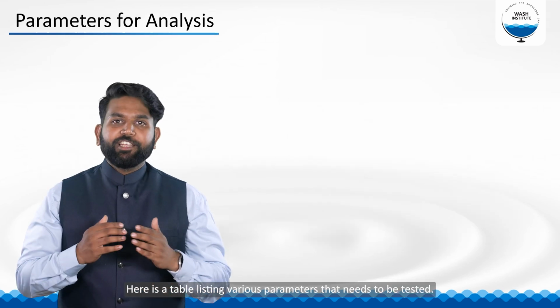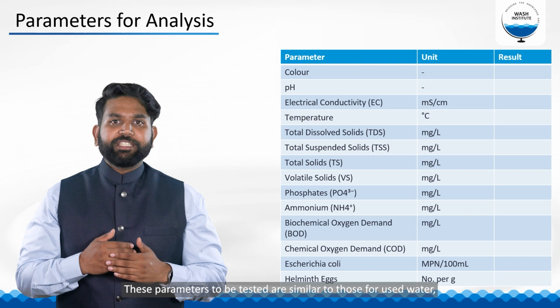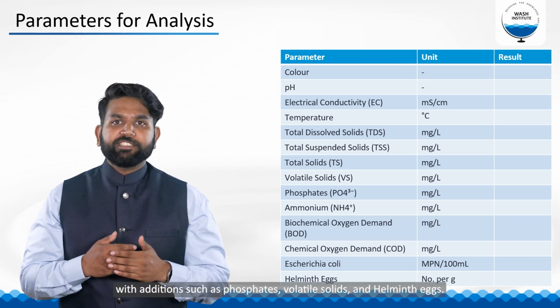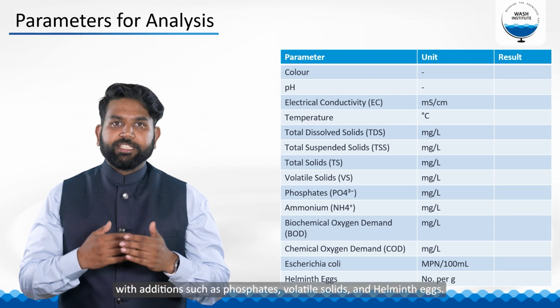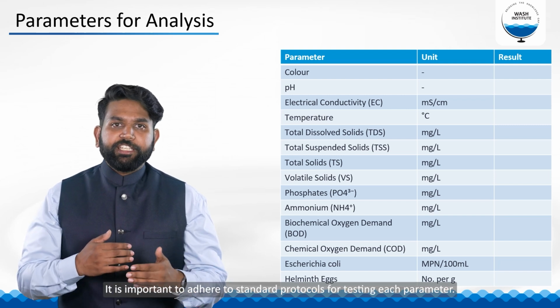Here is a table listing various parameters that need to be tested. These parameters are similar to those of the used water, with additions such as phosphates, volatile solids, and helminth eggs. It is important to adhere to standard protocols for testing each parameter.